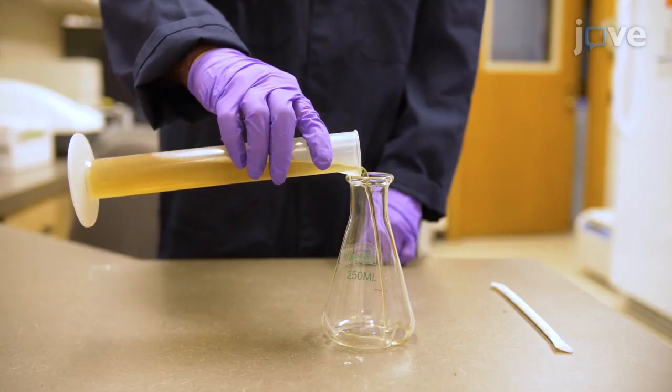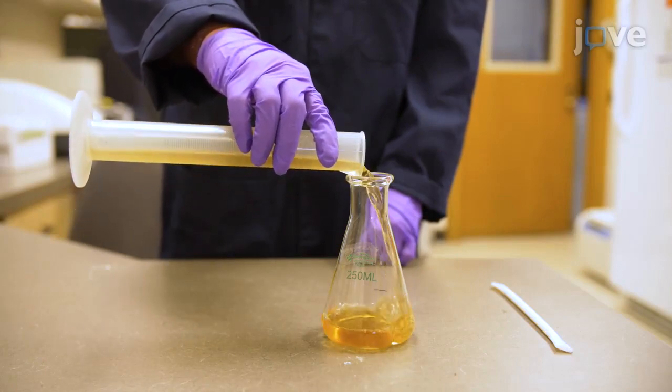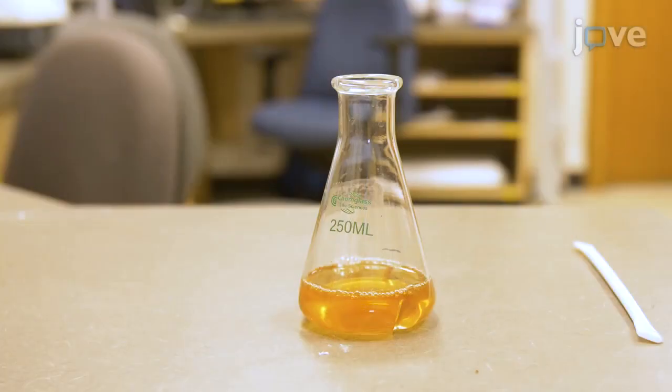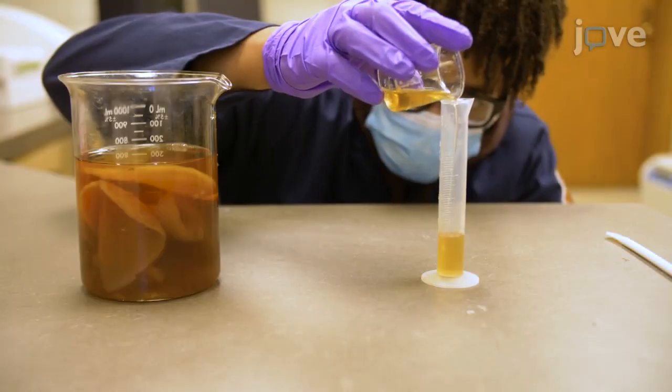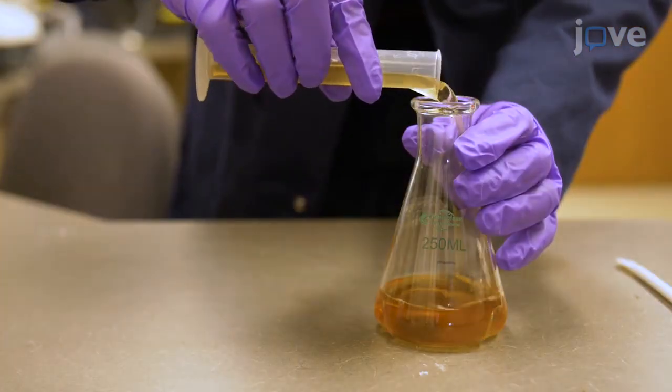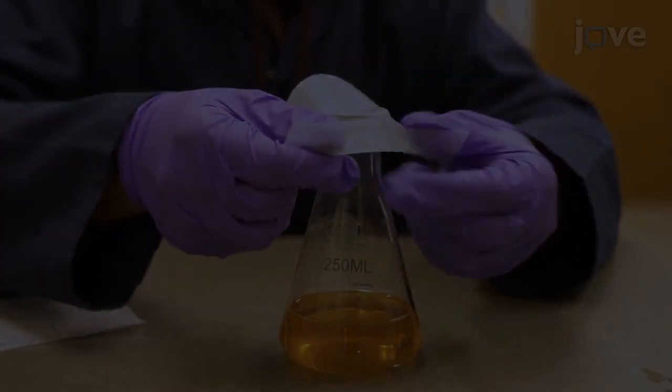Transfer 80 milliliters of the prepared acidic tea mixture to a 250 milliliter baffled flask and allow the tea mixture to cool to 20 to 25 degrees Celsius. Add 20 milliliters of microbial starter culture liquid to the baffled flask when the liquid is at room temperature and cover the flask.